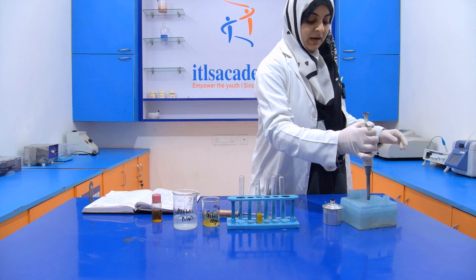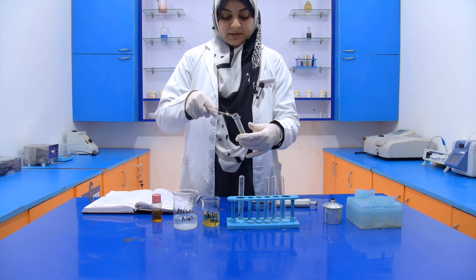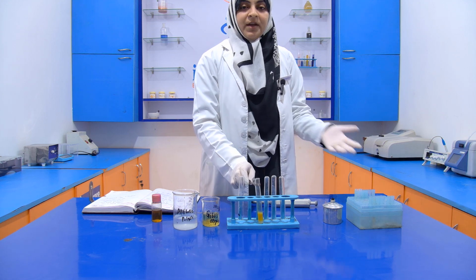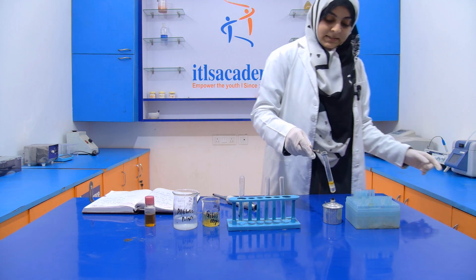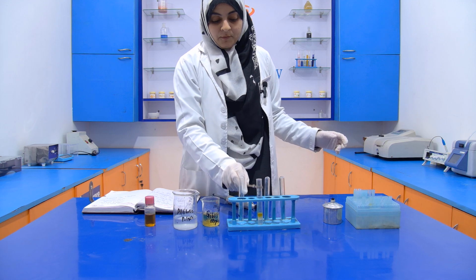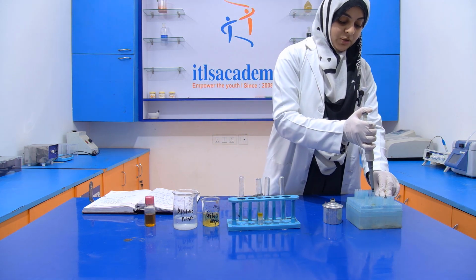Now after that, we have to heat it for 2 minutes on a burner. Then this color will disappear. Okay. Now we will see the result after 2 minutes, because we have to heat it for at least 2 minutes. See that when we are heating it, its color disappears. Okay, it is decolorized. Now after that, when its color is decolorized, then we have to add 1 ml of Gibbs reagent into it.